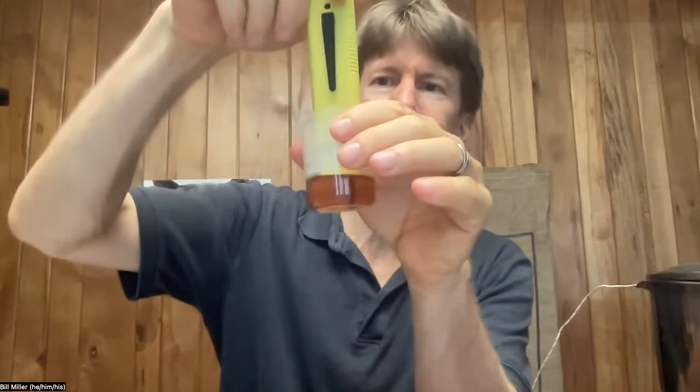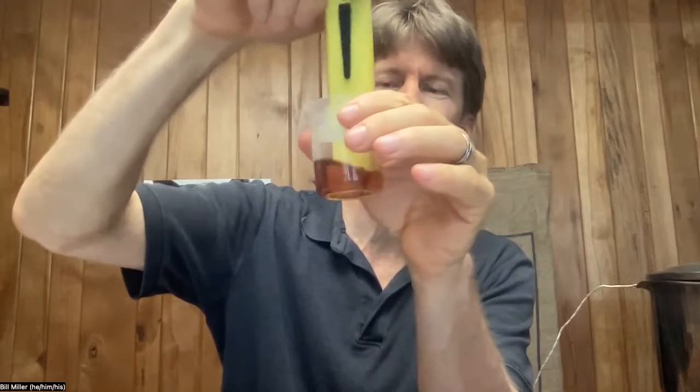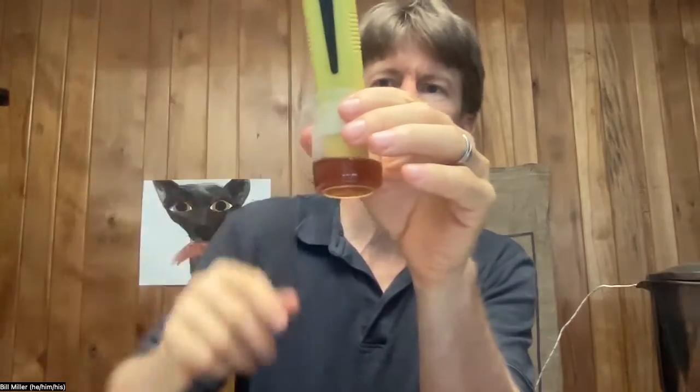I'm going to take my pH measurement now. I'm going to put it in my coffee with my 15 milliliters. I don't know if you can see that — 5.06. That's going to be my starting point.